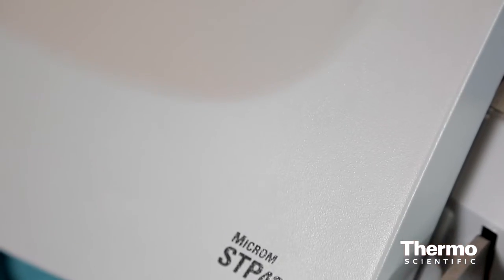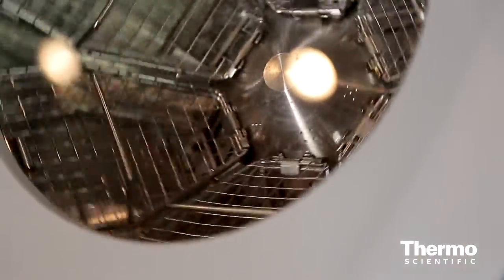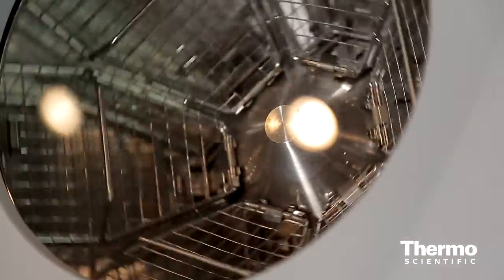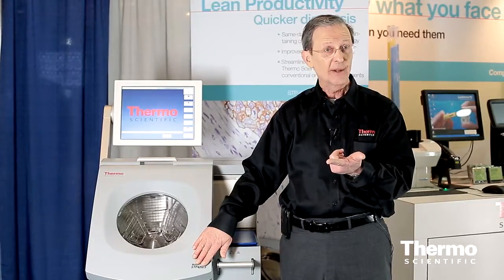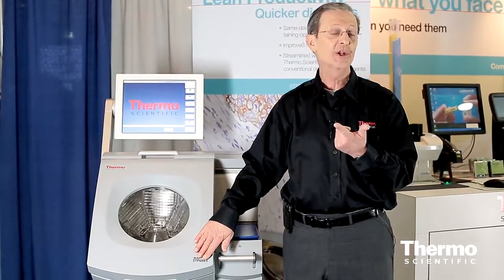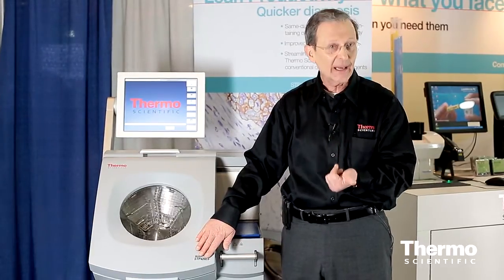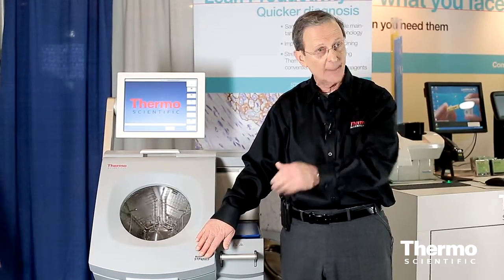This is state-of-the-art, so it has a revolutionary processing system that accelerates processing. We actually can do fast processing without heat, without microwave, therefore we're not mortgaging in any sense the molecular diagnostic tests that may be coming downstream.